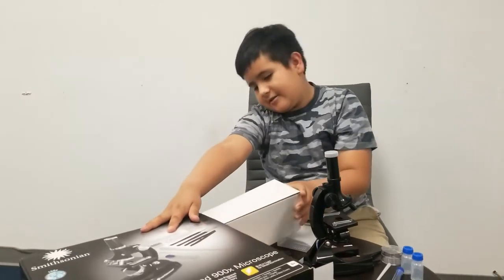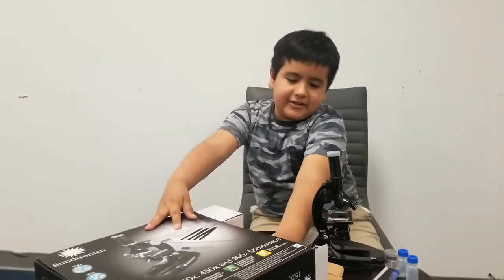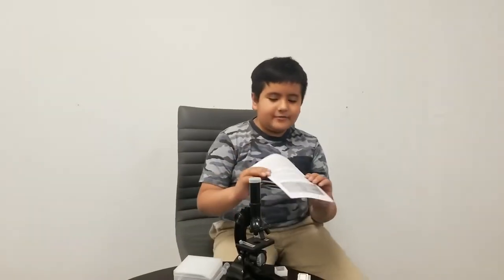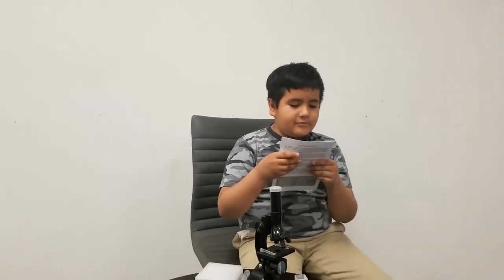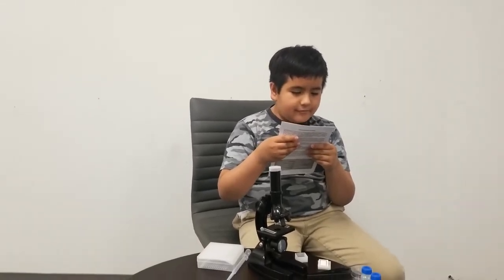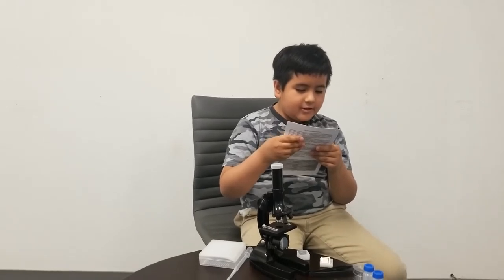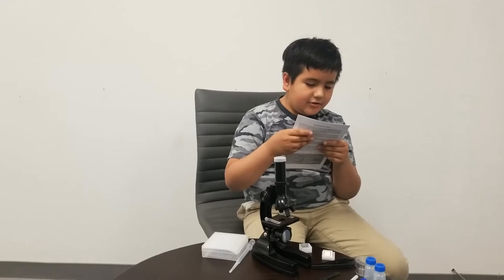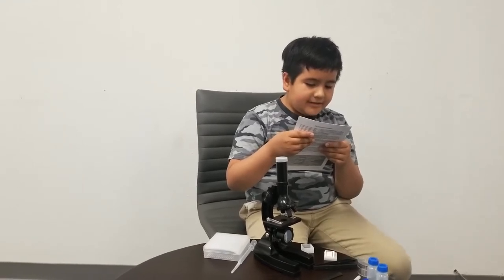Let's open this box — okay, nevermind, that has nothing in it, and neither does that. So I'm gonna read this manual right here. The name of parts: an eyepiece, a body tube, focusing knob, revolving turret, objective lens, arm, stage clip, mirror, illuminator, base. This is a 450 and 900 microscope, which is this.